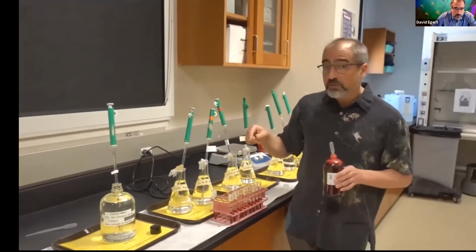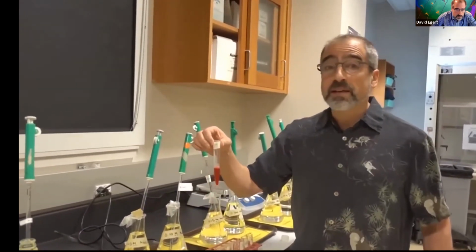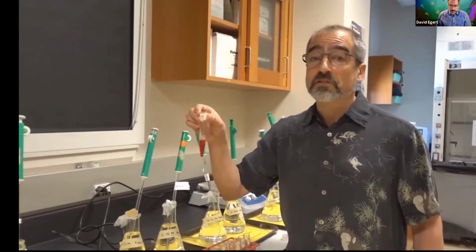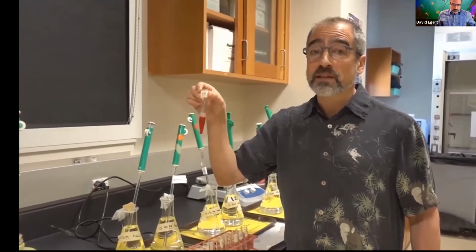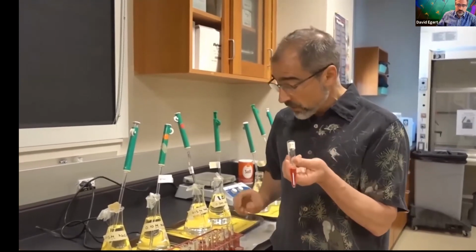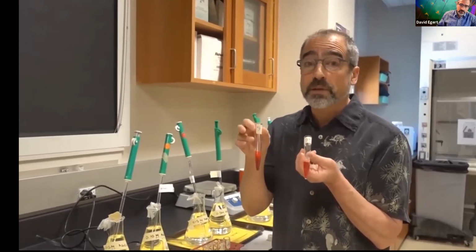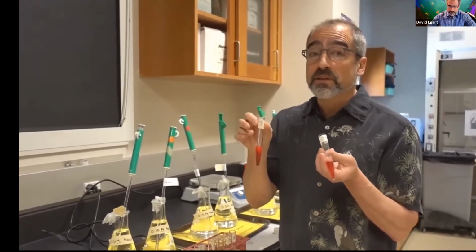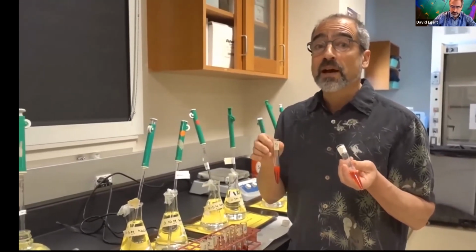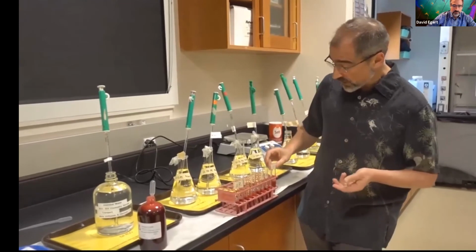I can also mention we have one tube here that we actually put the blood in about a half hour ago. This is a different version of tube 9 with the glycerol. We'll talk a little more about why we've created this, but we're going to be able to compare the blood that's been in glycerol for over a half an hour versus the blood that we've just added to glycerol just now, which we're going to be spinning down presently. So we'll be able to see how the amount of time the blood cells have been sitting in the solution affects the results. So again, we actually have 2 versions of 9.